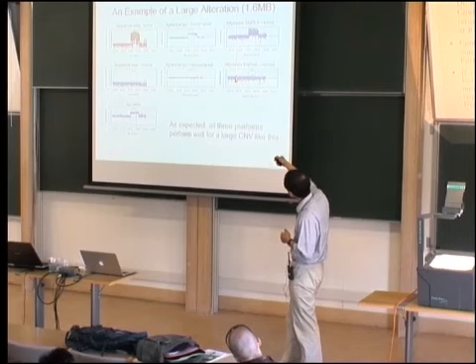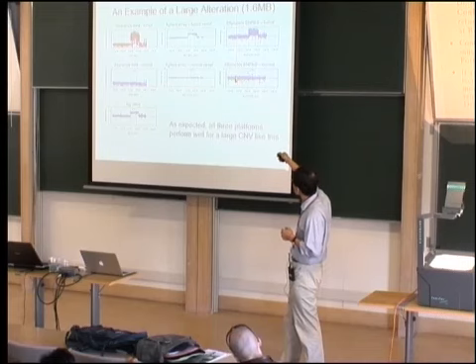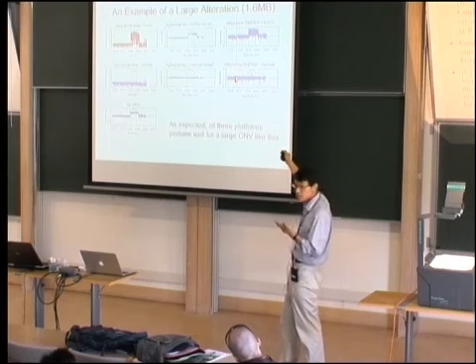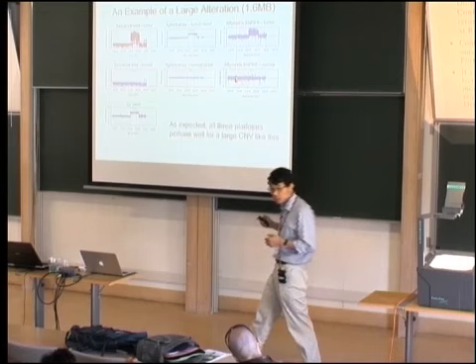If you look at Agilent array, this is a 2-channel array where you hybridize tumor versus reference, normal versus reference. This is SNP6, where you have higher density than Agilent, but generally the probes are shorter, and so they tend to be a little bit noisier. Okay? But it's pretty easy to detect in all platforms.